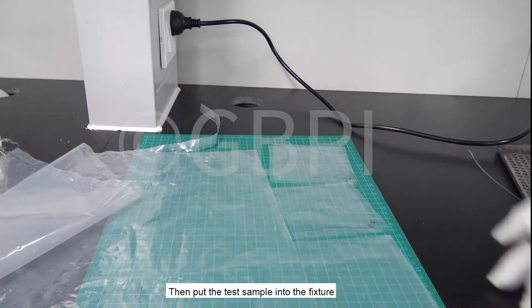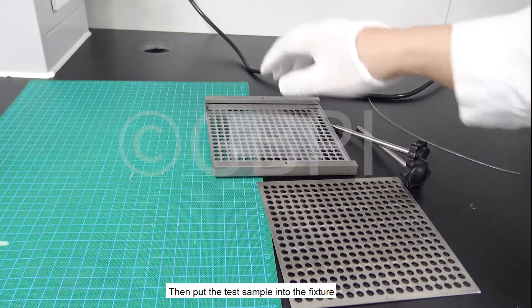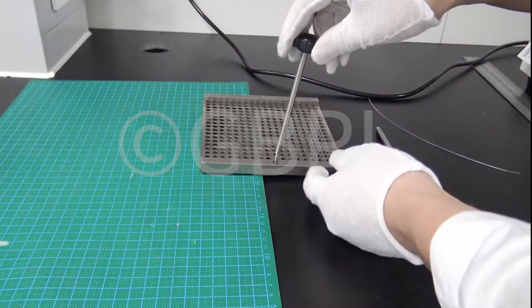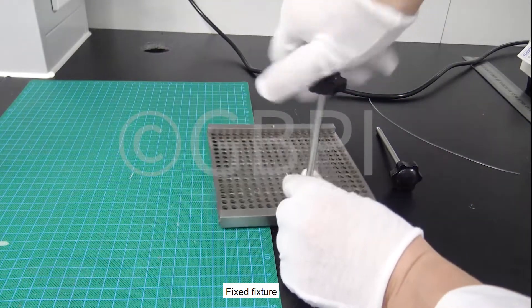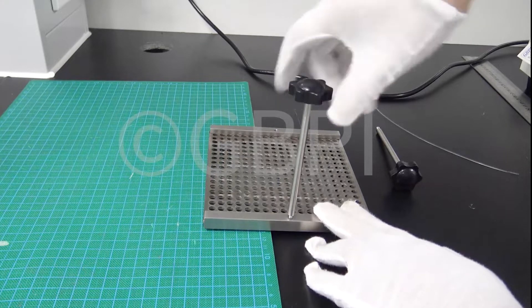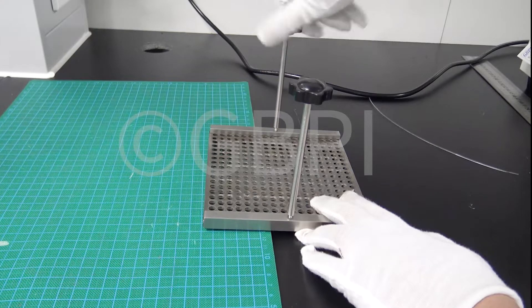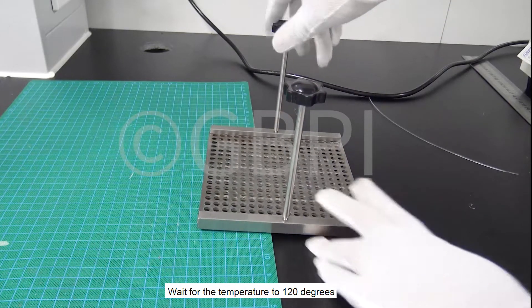Put the test sample into the fixture and fix it securely. Wait for the temperature to reach 120 degrees.